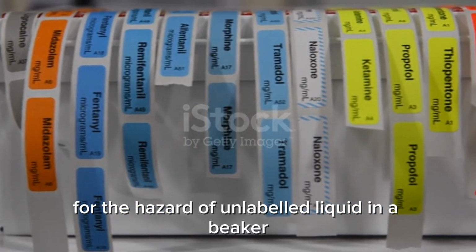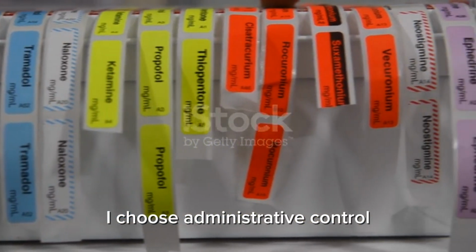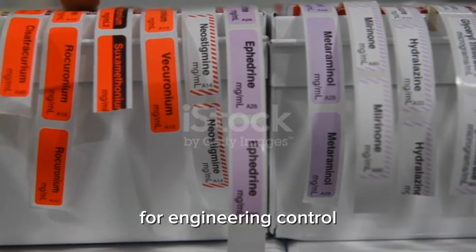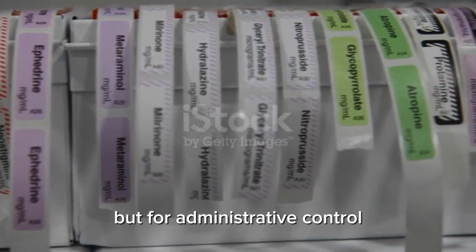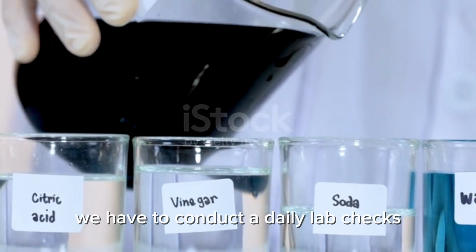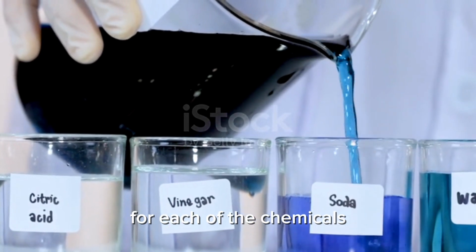For the hazard of unlabeled liquid in a beaker, I choose administrative control and also engineering control. For engineering control, a mandatory labeling system will be introduced. But for administrative control, we have to conduct daily lab checks to confirm proper labeling for each of the chemicals.